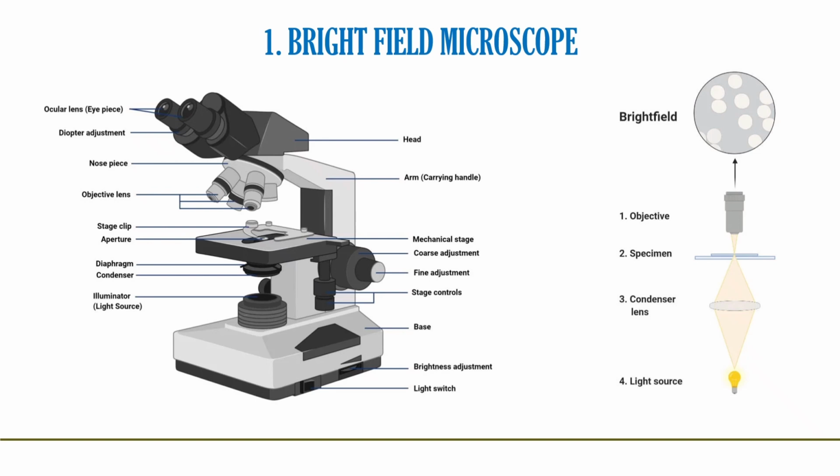Two lenses, which include the objective lens and the eyepiece or ocular lens. An eyepiece, also called an ocular lens, is the lens that you look through in a microscope or other optical device. The objective lens first collects light and forms an image. The eyepiece is placed near this image and magnifies it so it can be seen clearly. The amount of magnification depends on the focal length of the eyepiece.